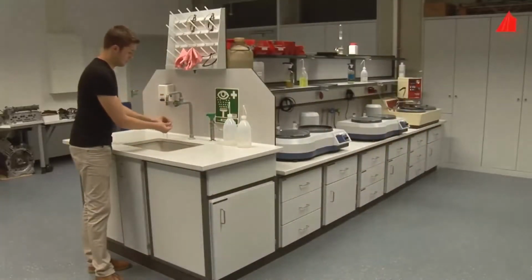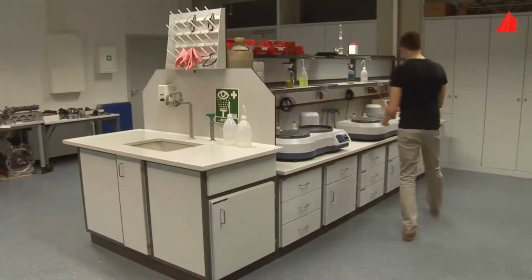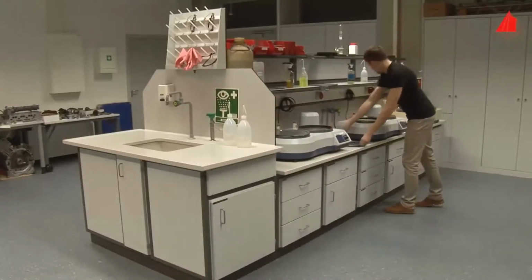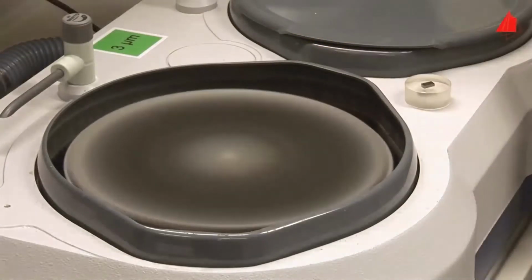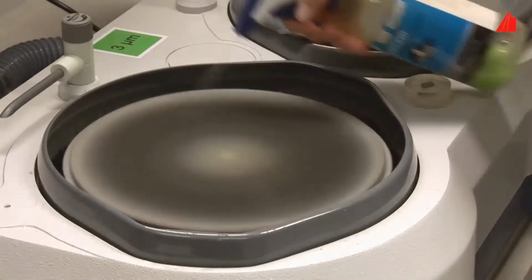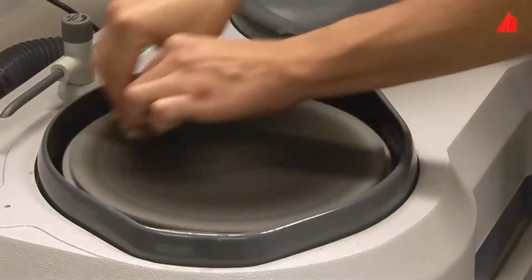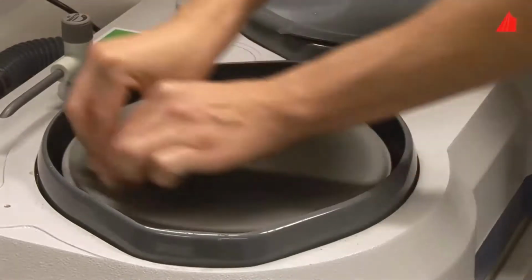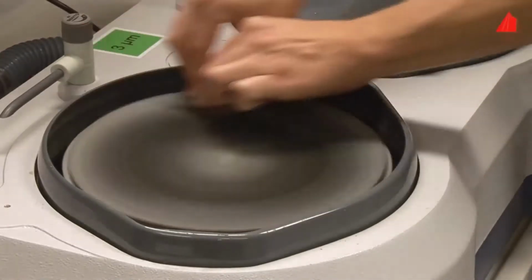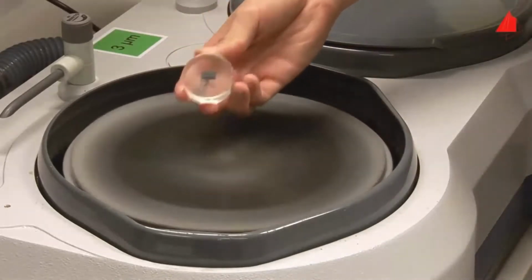To remove them, the material tester washes the specimen and his hands again very carefully and polishes the specimen for a second time. Now he uses a softer short nap polishing pad, finer diamond suspension of 3 micrometer particle size and less pressure. After the second polishing operation, the specimen surface has an almost mirror-like appearance. No more scratches can be seen with the naked eye.